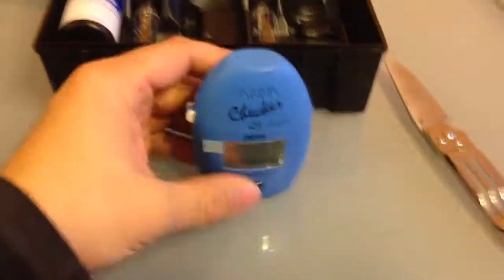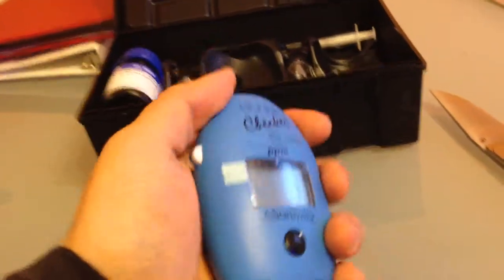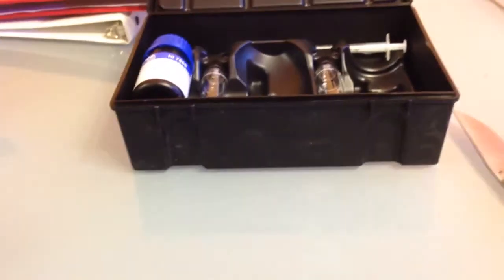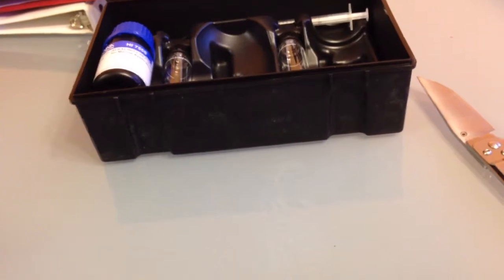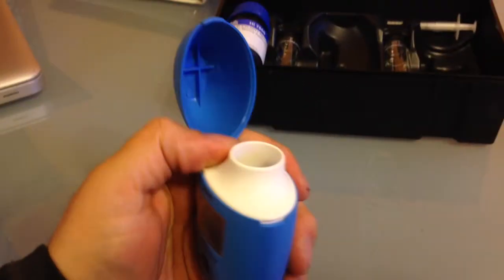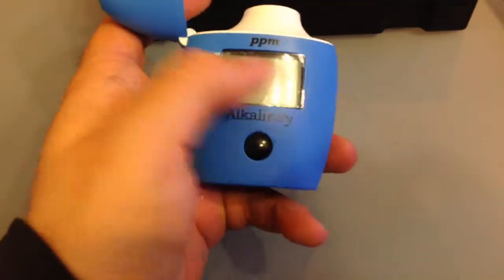Alright, there it is — looks pretty good. Let's see if I can open it. There's a little button. It's just a click — open it. There's this thing I've seen a lot in videos. Inside there's a little photo sensor. Pretty good — the cover comes off.